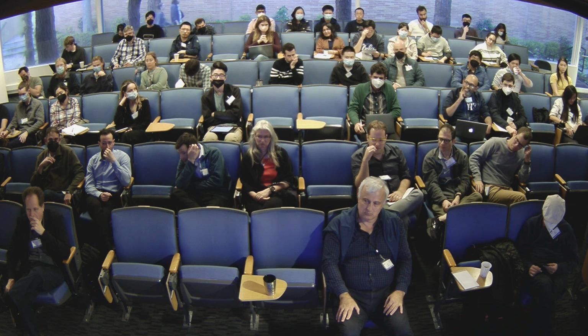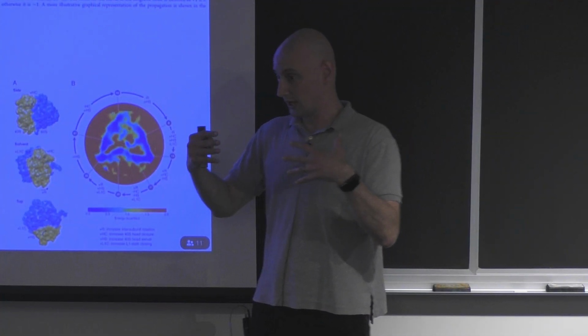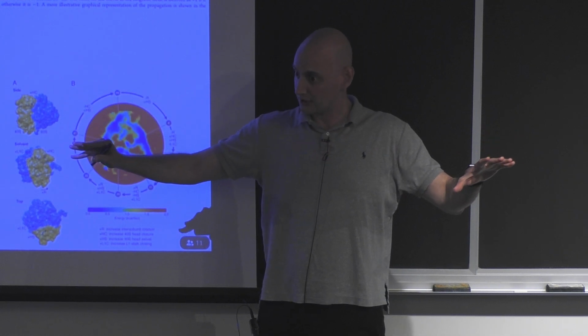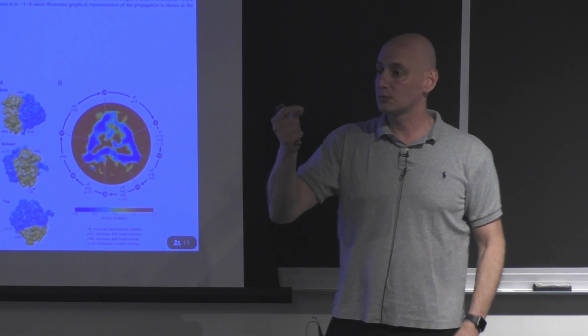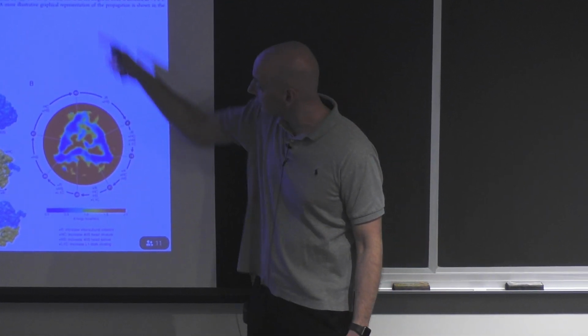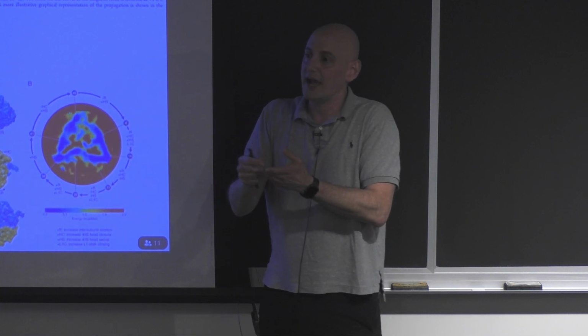And one of the issues, I didn't want to go into all the possible things, but these issues, by the way, affect all the methods that we're talking about, not just this approach, is probably that the latent variable that we learn for the conformation, so for each image where it is on this map, is probably not that accurate.